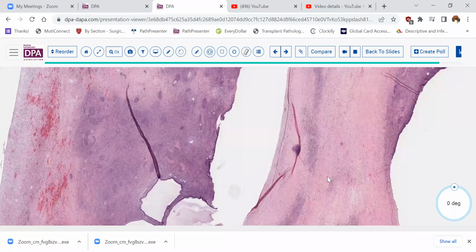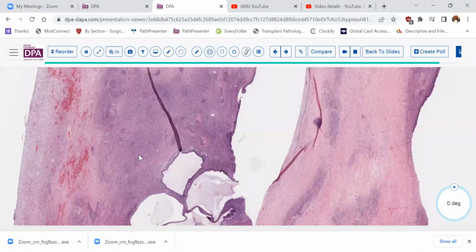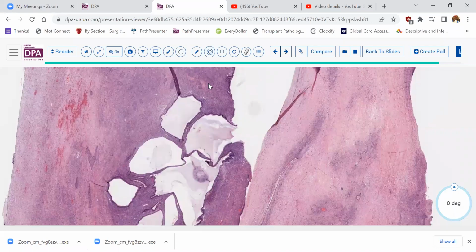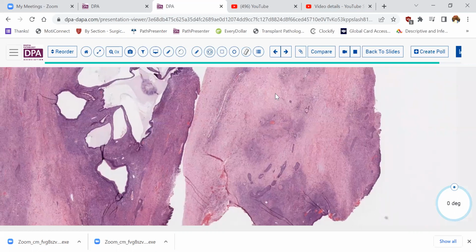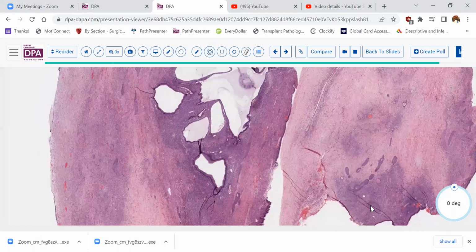The second feature here, of course, is that there probably is some molecular association of these two lesions, because it's certainly much more frequently encountered than, say, other combined tumors. And so the relationship between a Brenner tumor and a mucinous tumor in the ovary remains an interesting course for etiologic investigation and understanding of that process. Now, of course, this can also be the circumstance where you can occasionally get mucinous carcinomas arising from these tumors with an associated Brenner tumor.